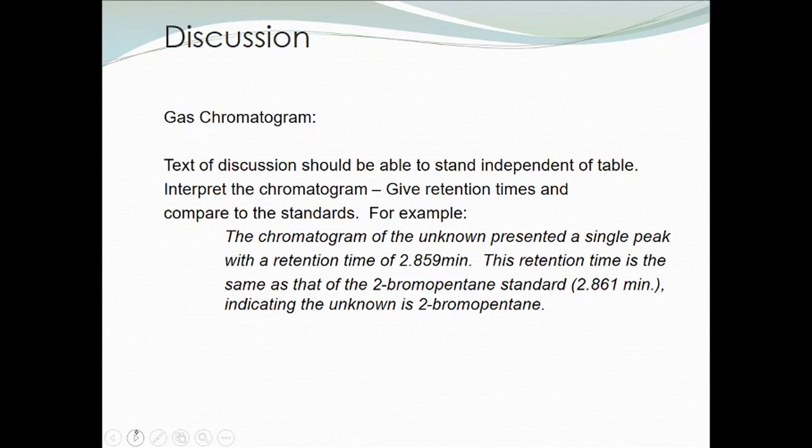That retention time is the same as that of 2-bromopentane. Again, give that retention time as well. Anytime you compare two values, always give the numbers so your reader can determine whether or not they agree that the numbers are close or that the numbers are the same. In this case, I state they're the same, and really, for all practical purposes, 2.859 minutes is the same retention time as 2.861. And then draw the conclusion. This indicates the unknown was 2-bromopentane.